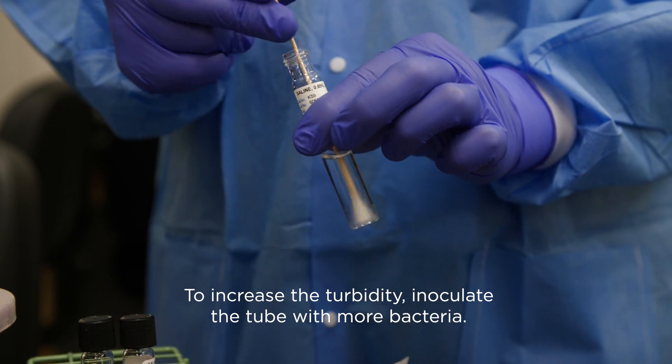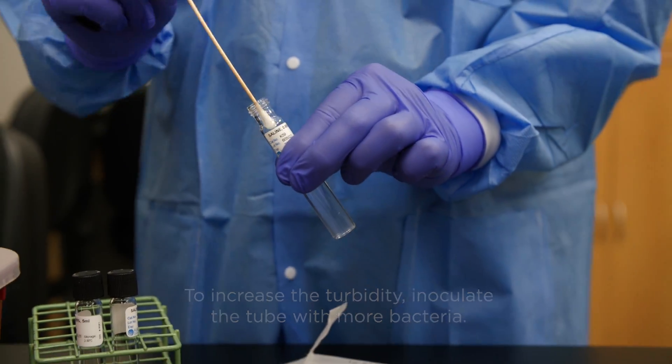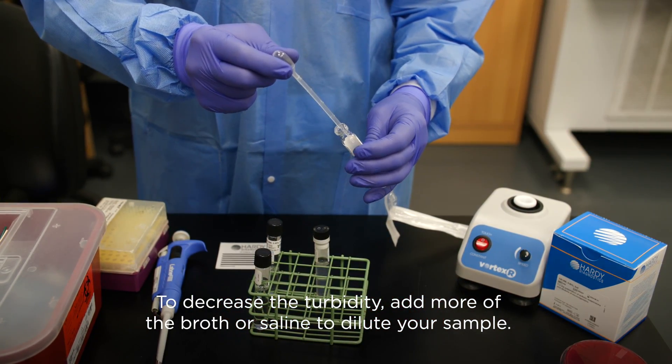To increase the turbidity, inoculate the tube with more bacteria from the swab. To decrease the turbidity, add more of the broth or saline to dilute your sample.